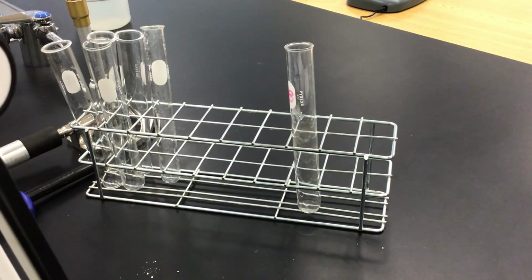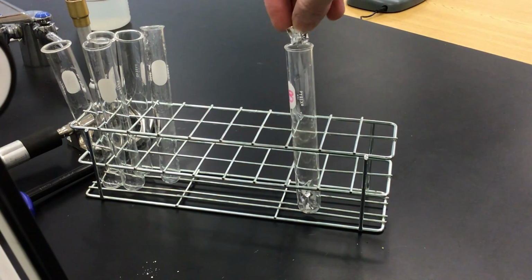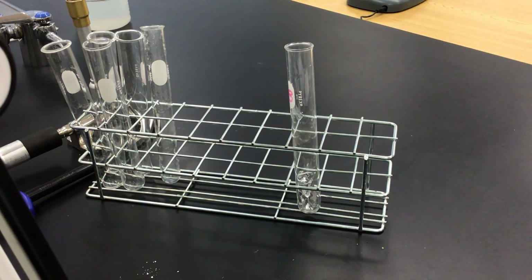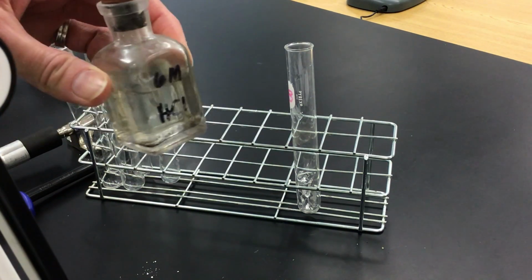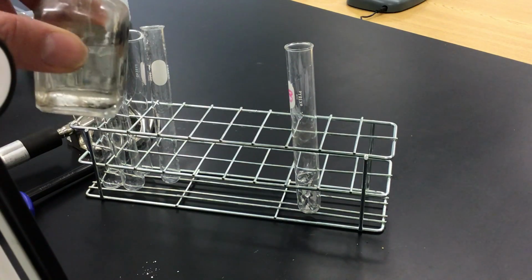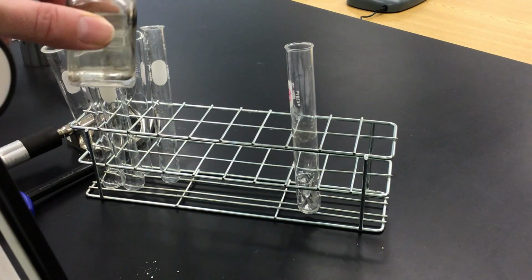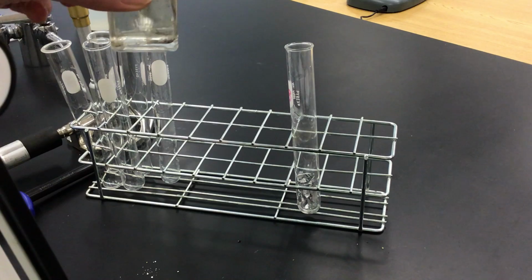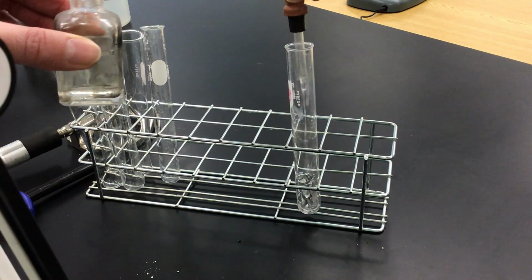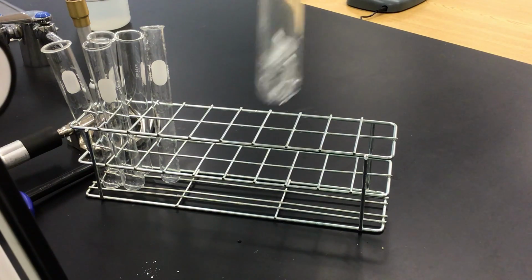Okay, so our first demo is that we are putting aluminum foil in a test tube and just lightly crumpled it up, and then hydrochloric acid. Notice that the hydrochloric acid is clear. We will call that aqueous. So we're going to add our hydrochloric acid to our aluminum foil. I'm going to put 3 dropperfuls in there, and then we're going to observe what is happening.